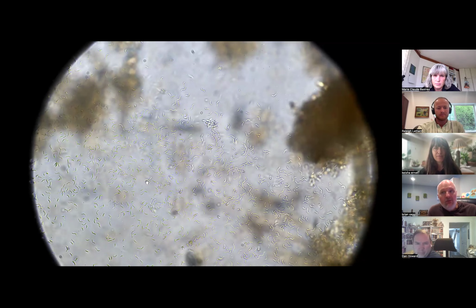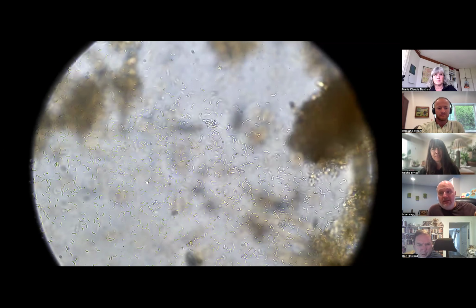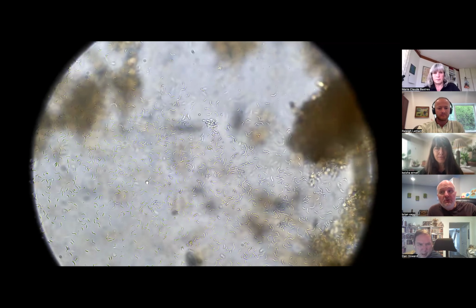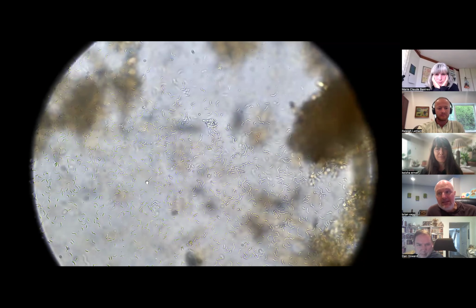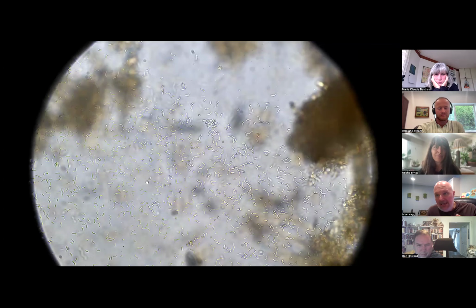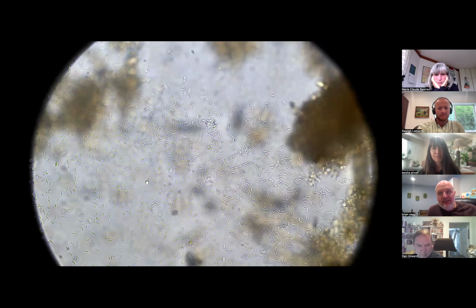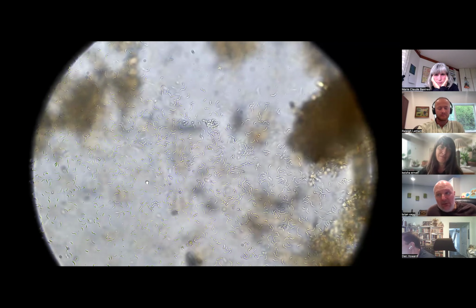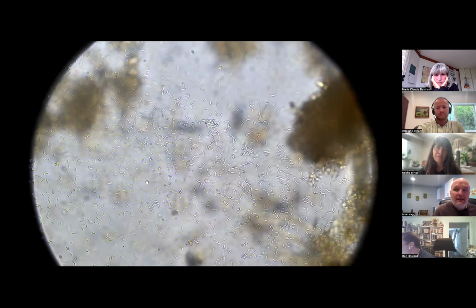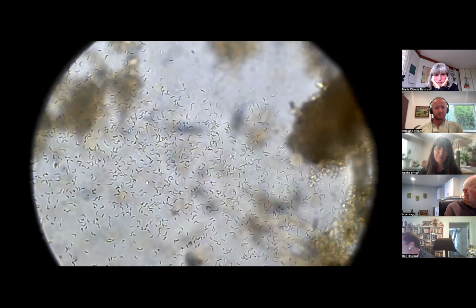And then they'll go ahead and replicate and populate. And it's interesting, you can see through looking at the slide, there's areas that had more aerobic things starting to occur. The spirilla are gone. So this may be just an area in the slide that's still maintaining more of that anaerobic kind of condition. And I'm wondering with those rotifers stirring things up, and granted, it's under a cover slip, but maybe it's just enough by the side where it's able to pull enough oxygen in. I'm making some hypotheses here, but that's what I'm assuming has happened.